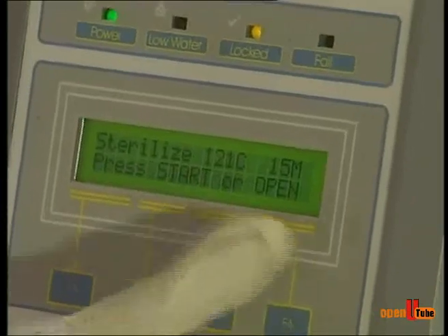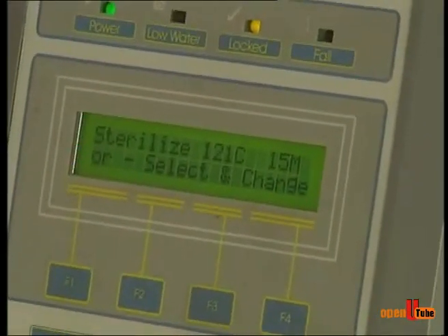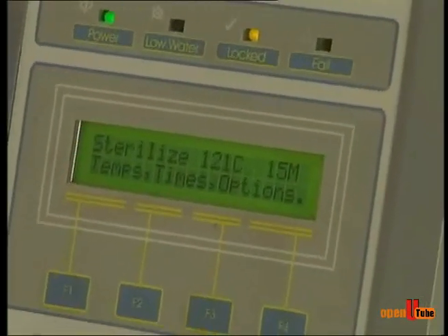After sterilization and cooling, we can keep the containers with the MS medium in a refrigerator until further use.